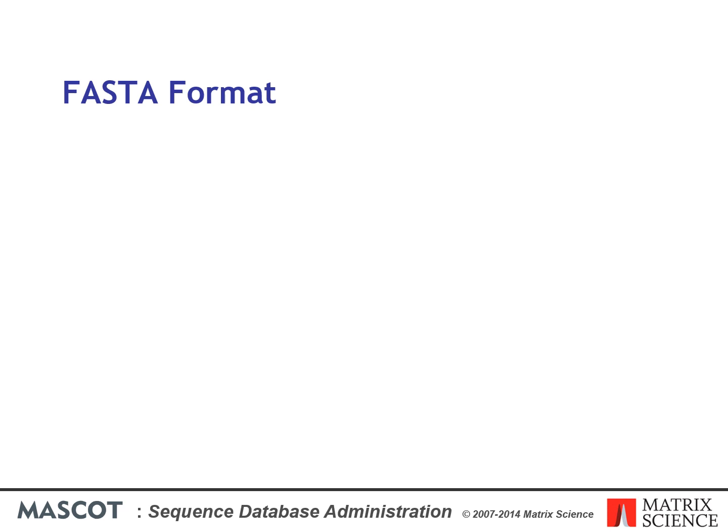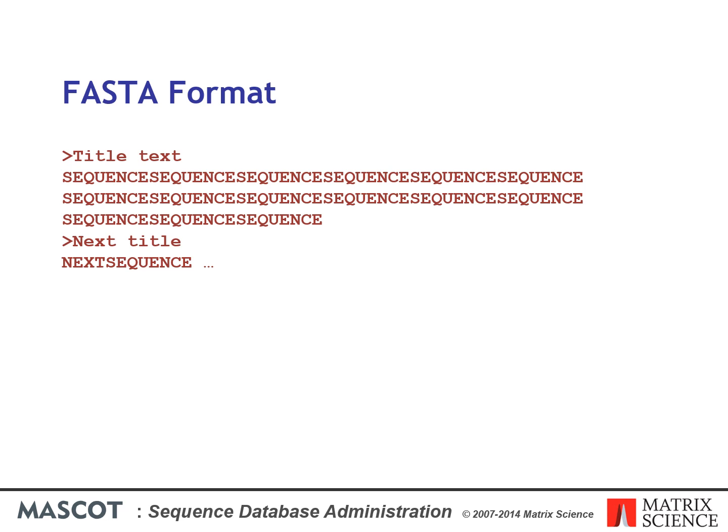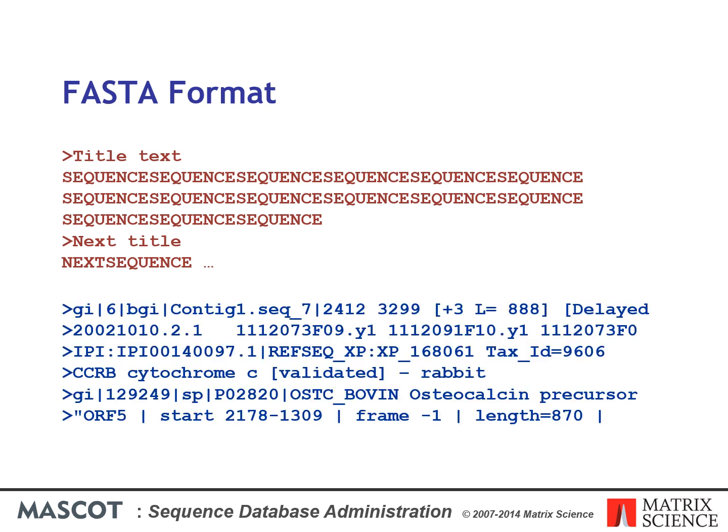Perhaps this is a good moment to clarify exactly what we mean by a Fasta file. Fasta is a very popular standard because it is so simple. On the downside, it isn't much of a standard and almost anything goes. Fasta specifies that there will be a title line, starting with a greater than character, followed by one or more lines containing the sequence in one-letter code. The problem is the lack of a well-defined syntax for the title line. Here are a handful of examples of Fasta title lines, and as you can see, there isn't much similarity.